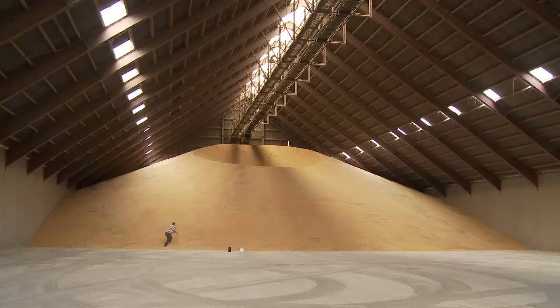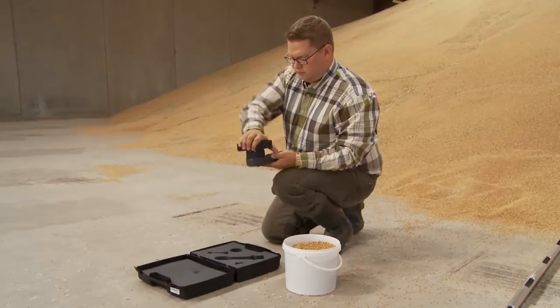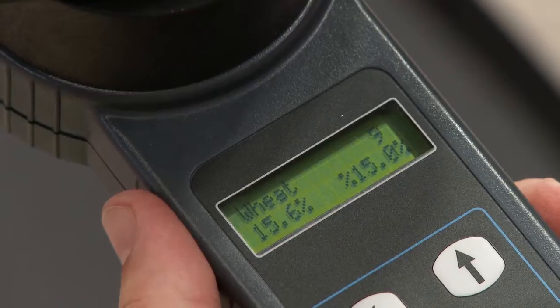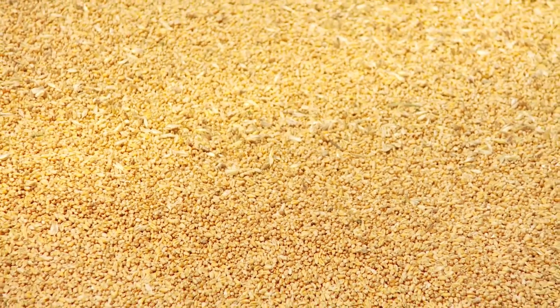Once the crops need to be stored, it is important to have the right moisture control to ensure the quality and avoid loss. The FarmPro Moisture Analyzer is perfect to give you exact measurements, so you can avoid high moisture and diseases to get the best price for your crops.